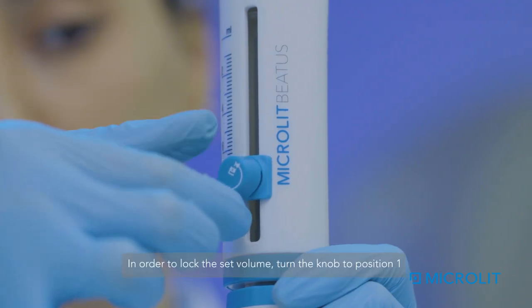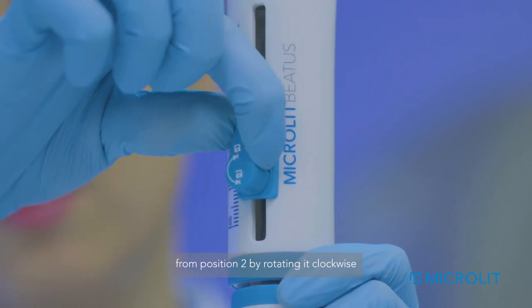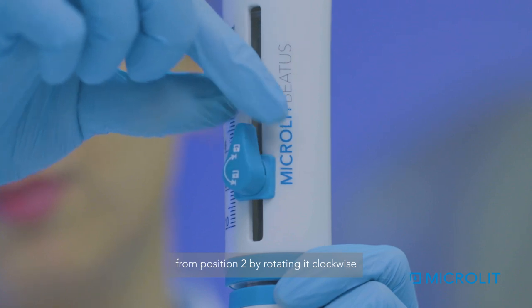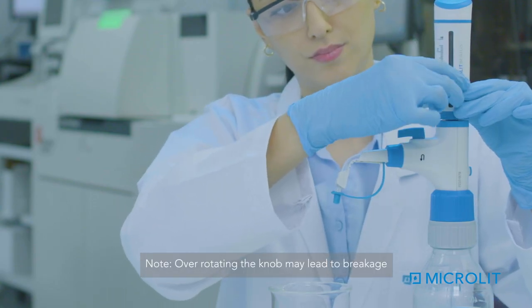In order to lock the set volume, turn the knob to position 1 from position 2 by rotating it clockwise. Over-rotating the knob may lead to breakage.